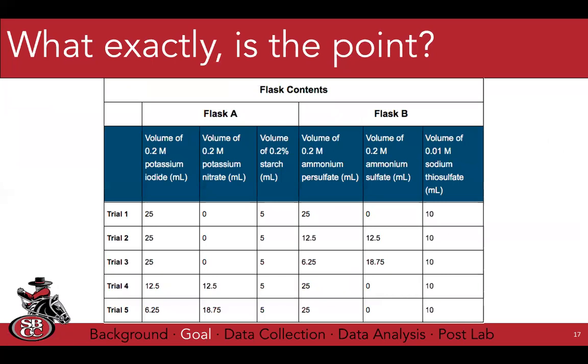Okay, so let's dig into it. I'll show you what it looks like and what we're going to do with the data. We're just doing 5 runs. So here's our iodide that we're putting in, and our starch, that's our indicator.